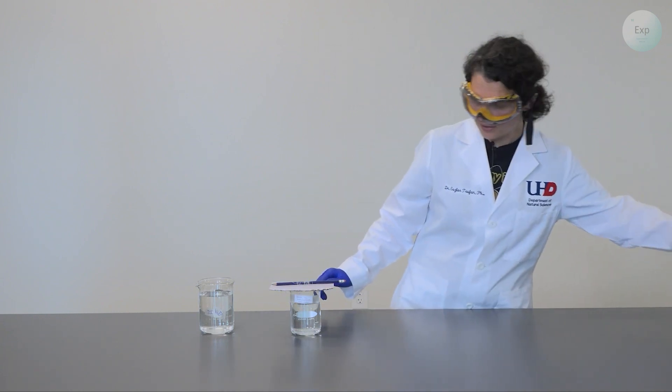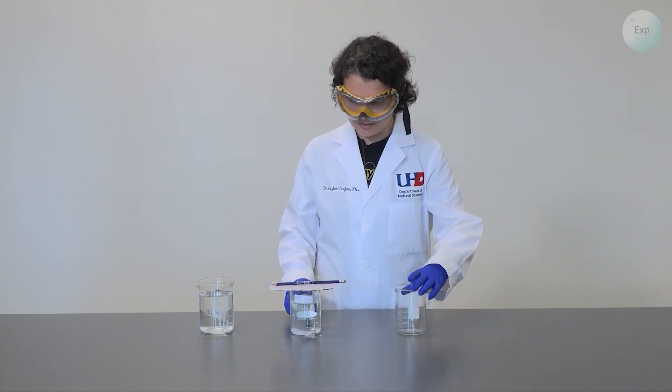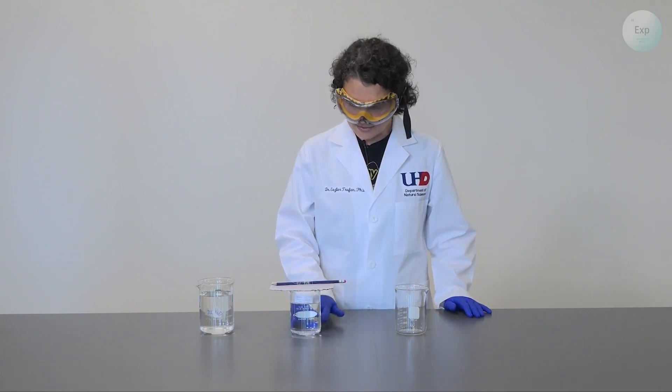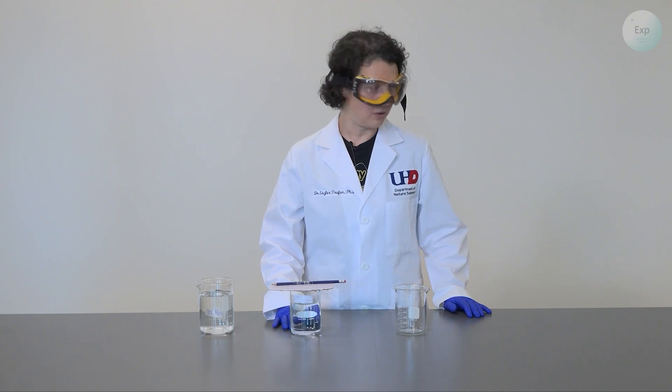Next, we're going to need another beaker in which we're going to decant our saturated alum solution because we need to remove all the little crystals that are involved.